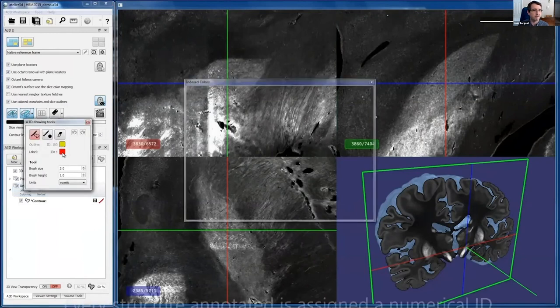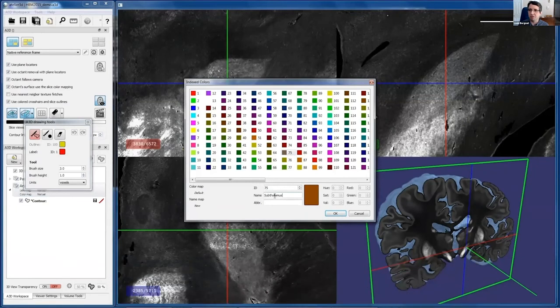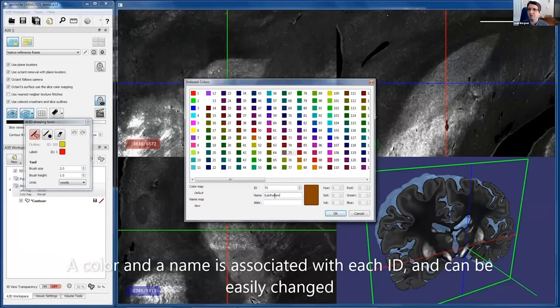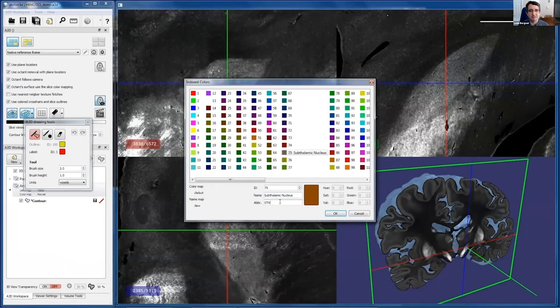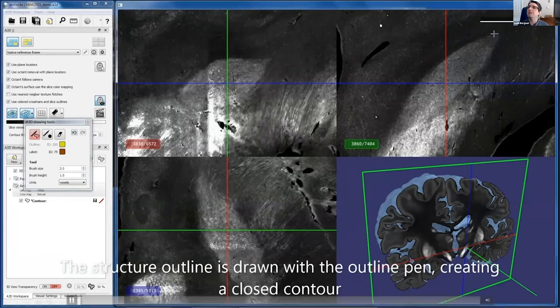It's the exact same format as the first cortical layer we opened. It's just a different use of that same format. This time, because we're actually starting our mapping process, we'll start naming structures, giving them numeric IDs in that file, so we'll be able to then process them to extract meshes.